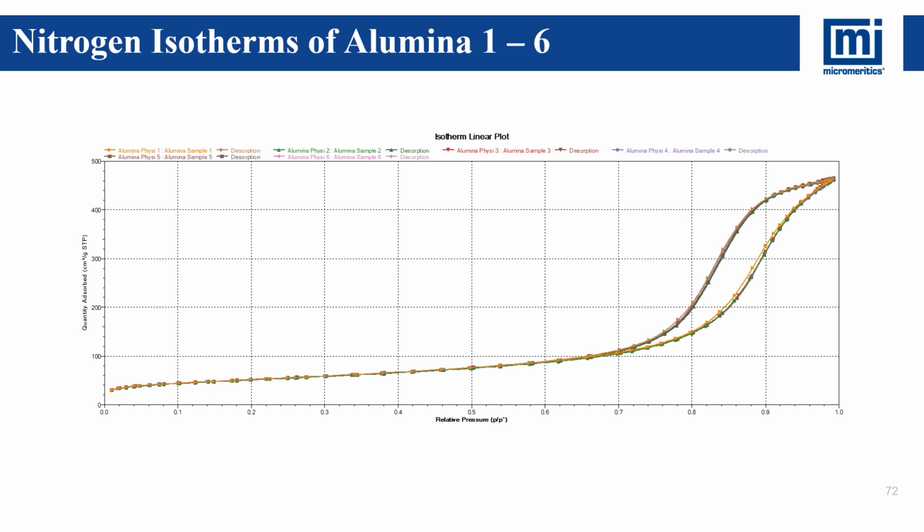The curves to the right hand side there at the higher pressure, that's the adsorption branch, and then to the left hand side is the desorption. Much like with mercury intrusion, the two branches are related to the sizes that are being filled. In this case though, for nitrogen, the adsorption is generally speaking assigned to the cavities and desorption assigned to the throats. Now remember, intrusion was assigned to the size of the throats. Desorption is assigned to the size of the throats, so we might think those would be comparable.